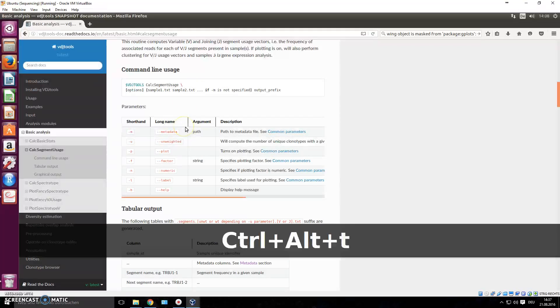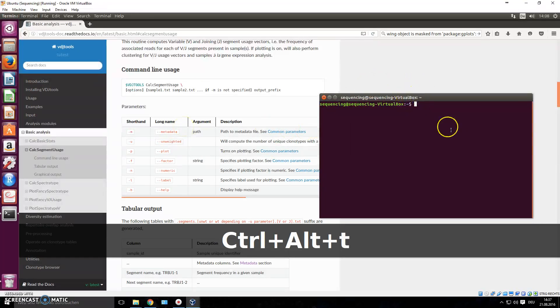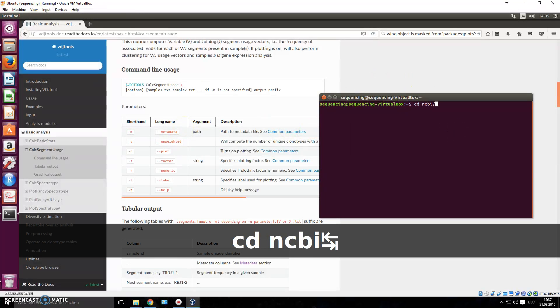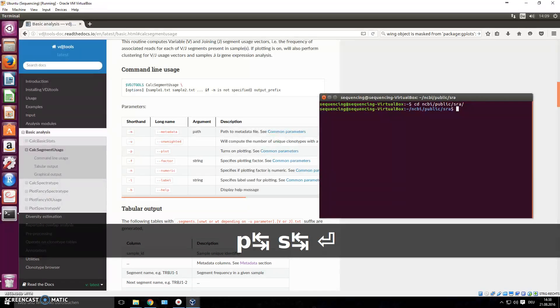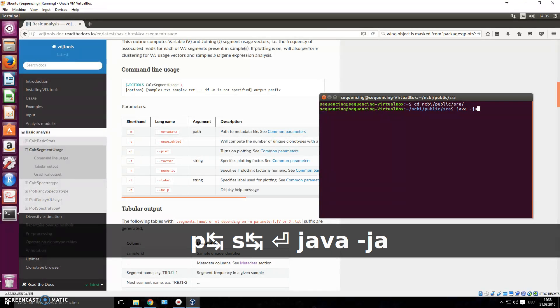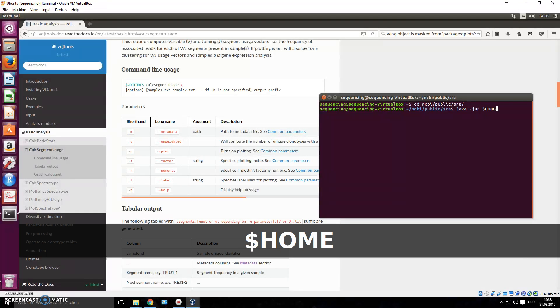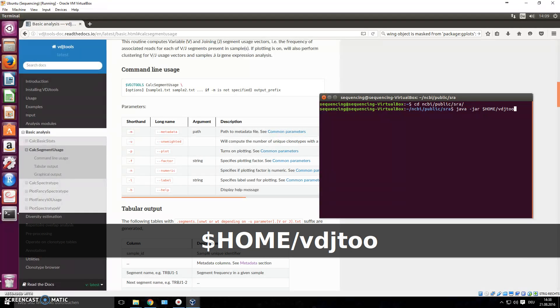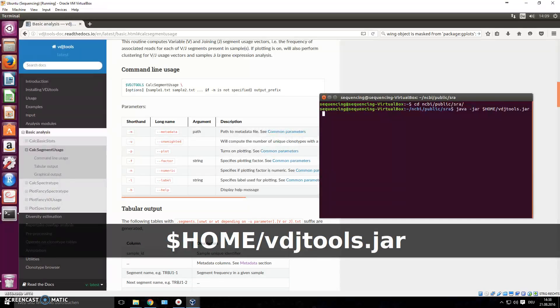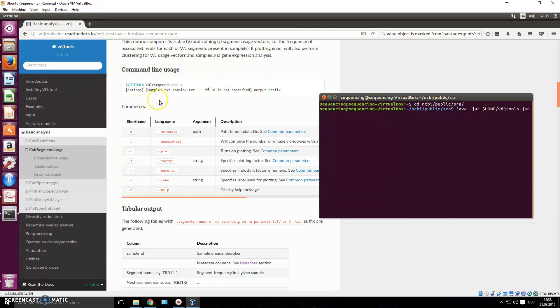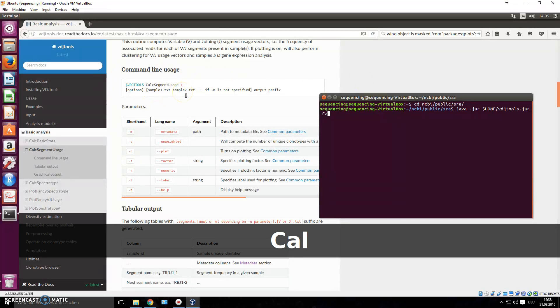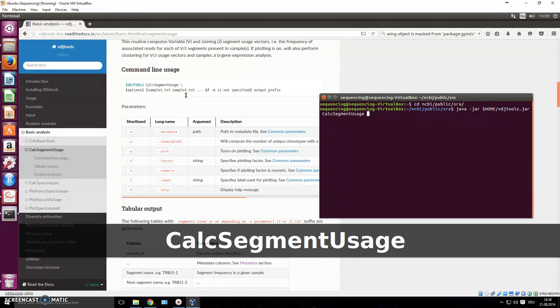Open up the terminal again and move into the directory where your samples are. We've converted them before, so go there and start the VDJ Tools command.